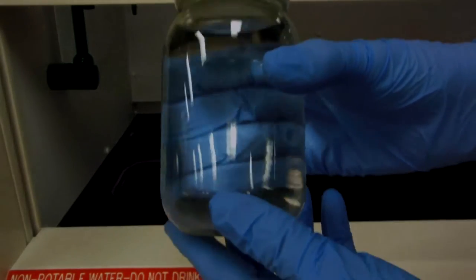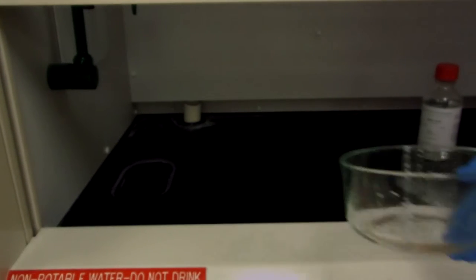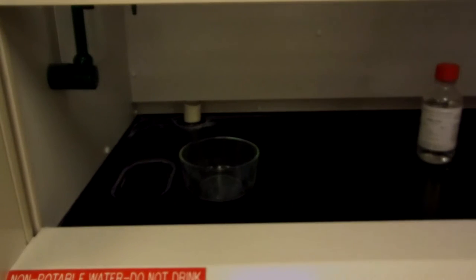So as you can see, it's already prepared with a small amount of silver dissolved in solution. I had previously tested the solution by using small pieces of Mylar, and it works well. So the cap is labeled with HNO3, nitric acid, and AgNO3, silver nitrate, now placed on my circular dish.